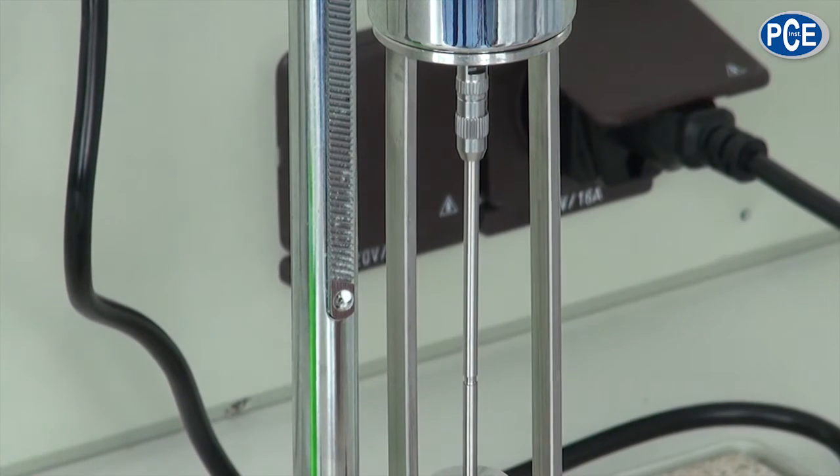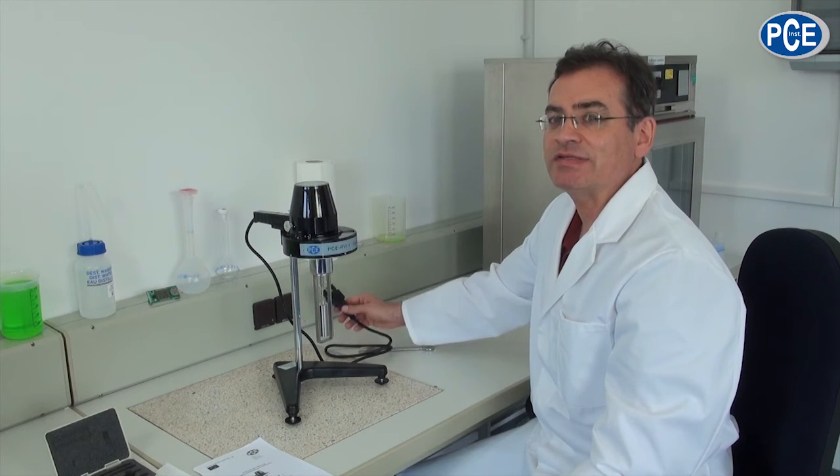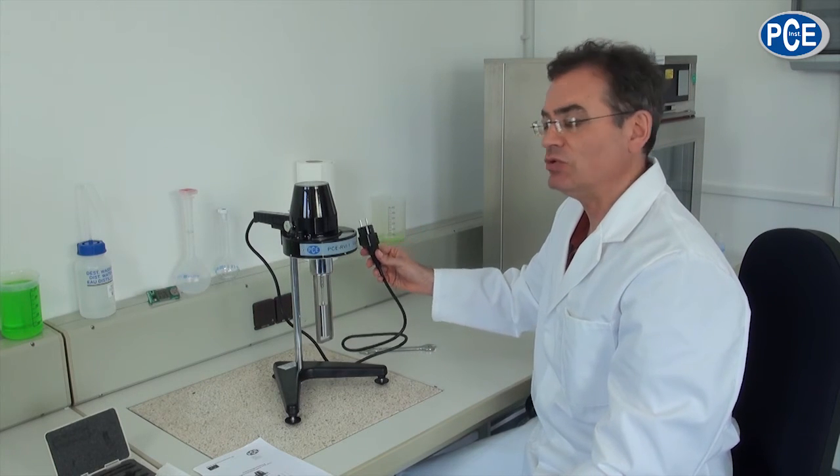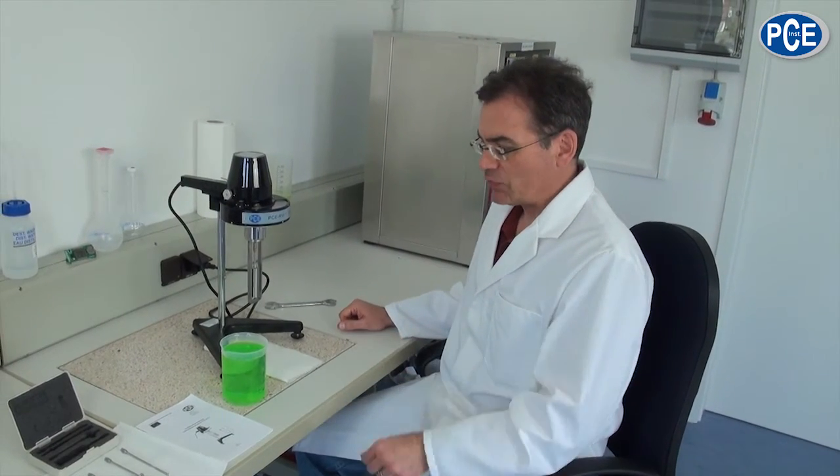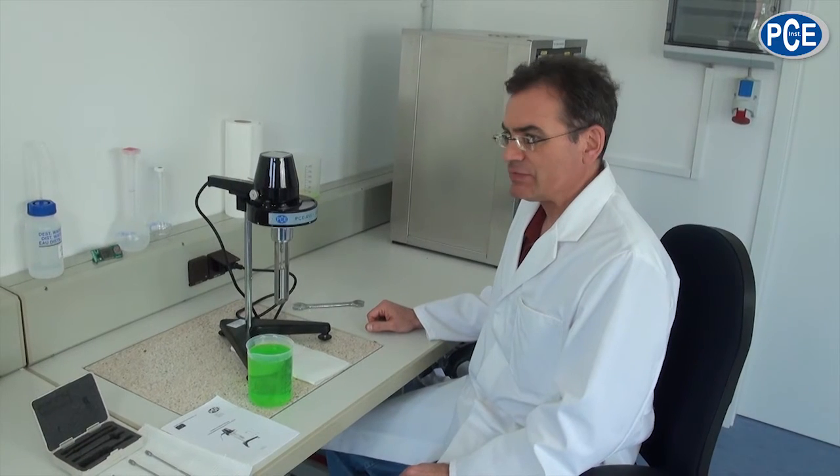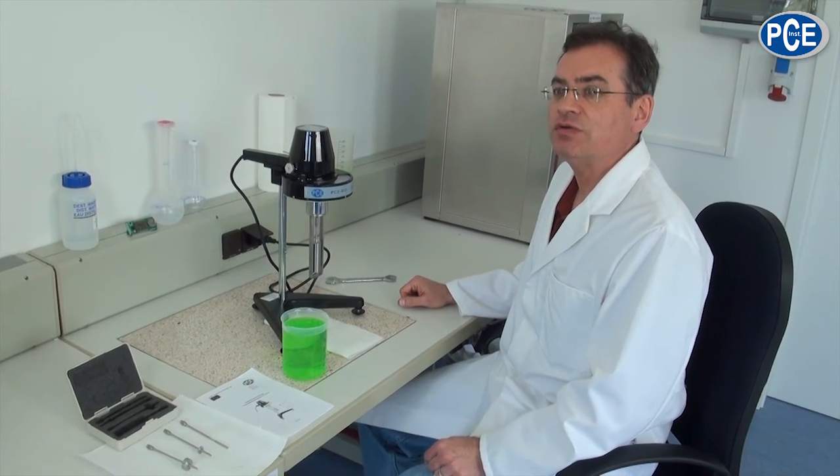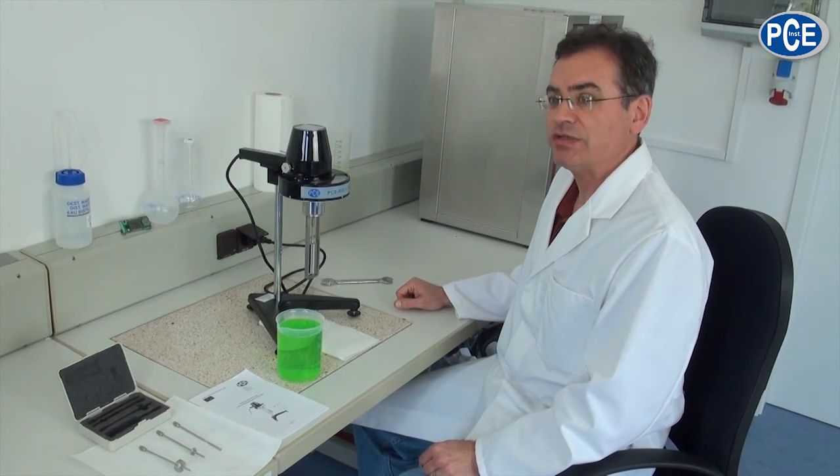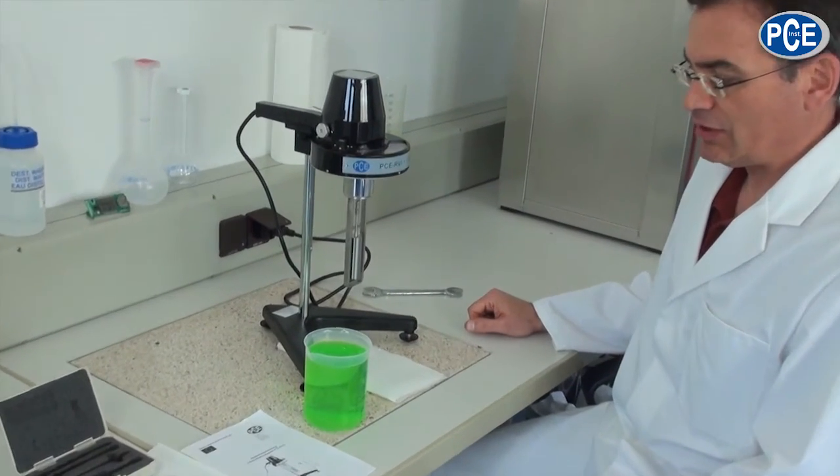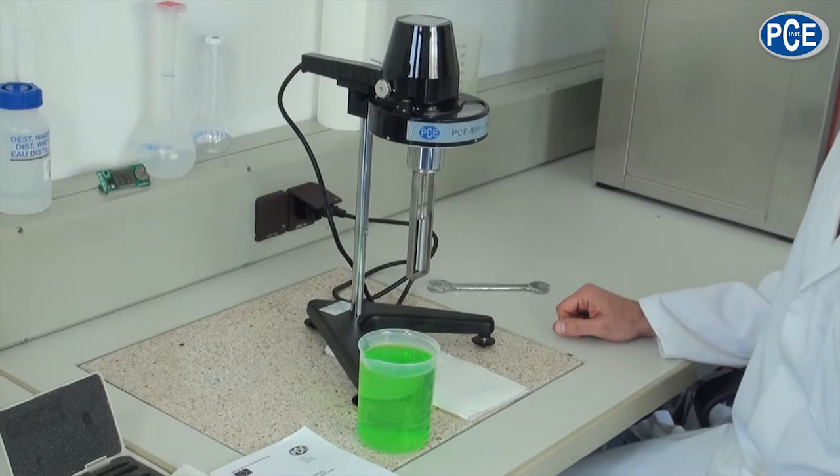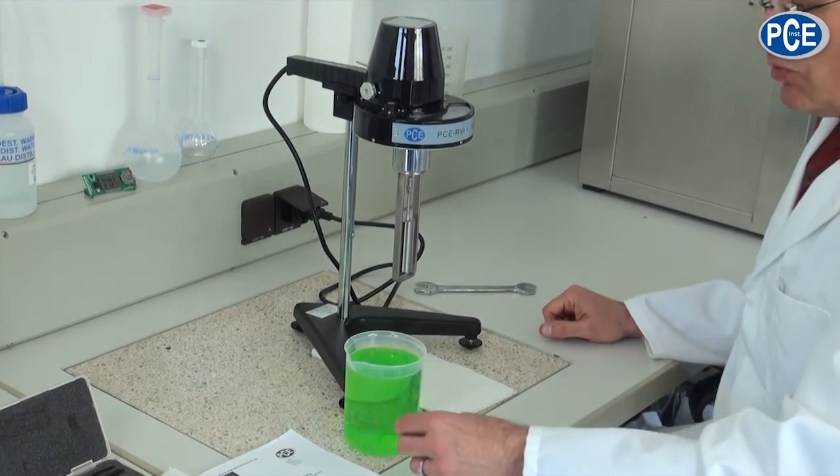And now the viscometer is ready to measure. For the first measurement the device is connected to the mains. Now we will do a measurement. For the probe we need a vessel with a height of about 130 mm and 70 mm diameter. This probe we have prepared. We put it underneath the rotation body.